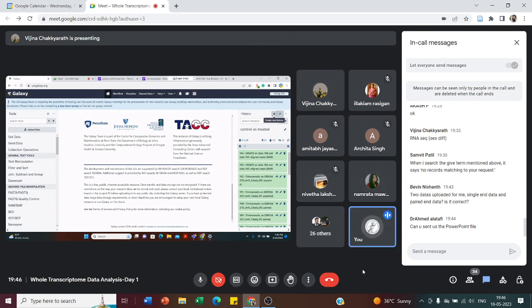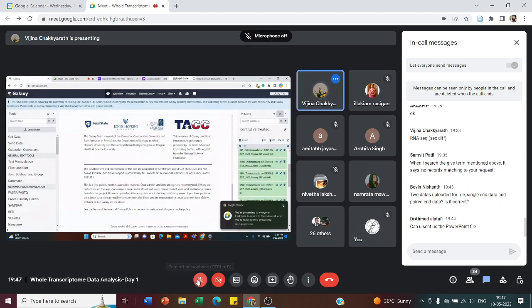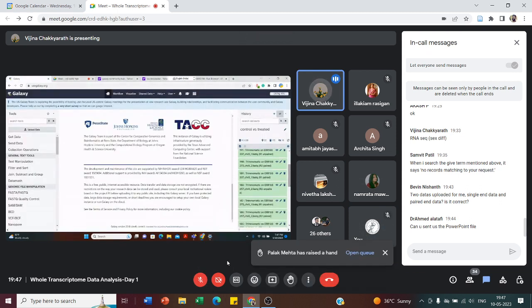Dr. Vijana, two questions are there. Bevin Nishant asked, two data sets uploaded for me, single end and paired end. Is it correct? I already downloaded that particular data, as I said in the tutorial session.